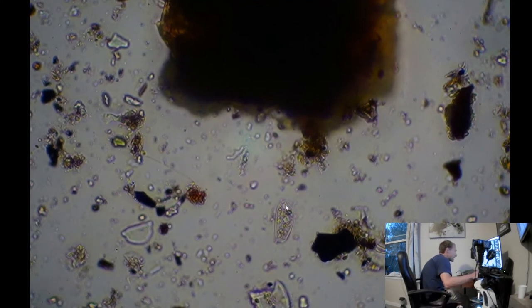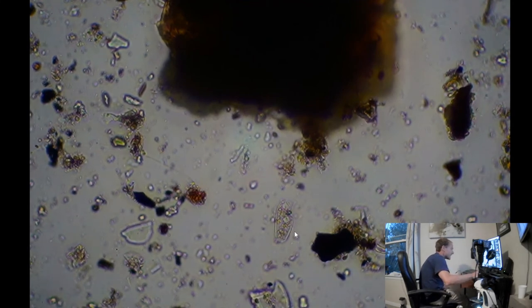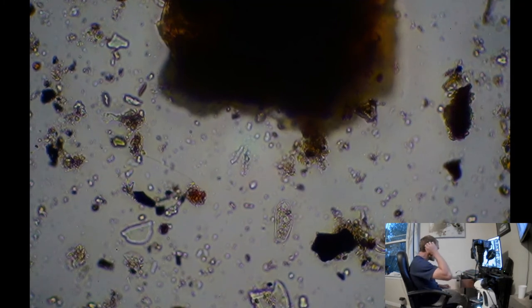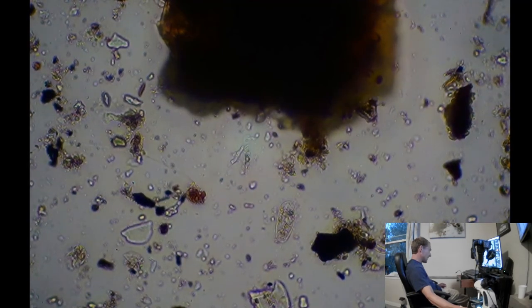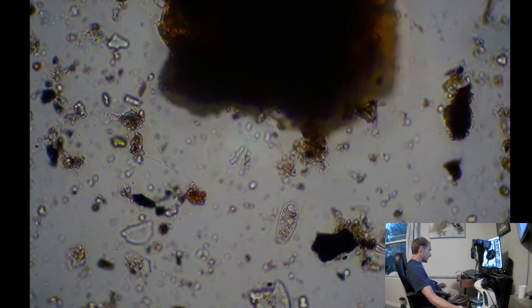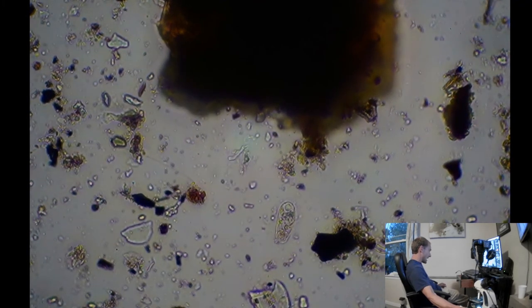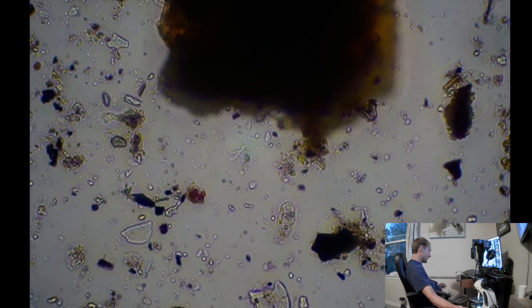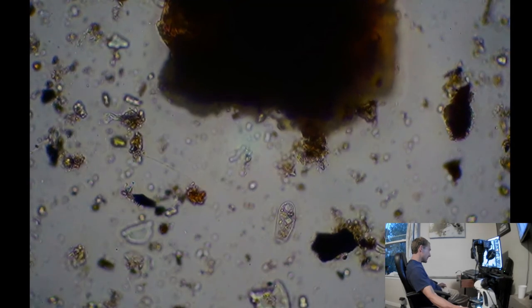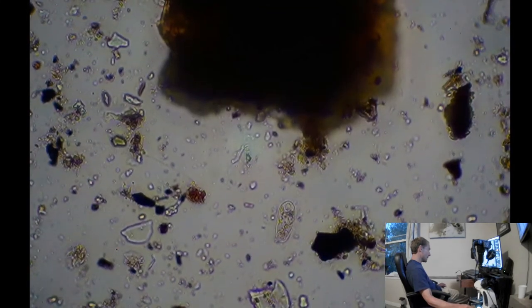And this, I can't remember the name of this amoeba. Testate amoeba, I think. But there's an amoeba for you. Another very good sign and something you want to see in your soil. It's them and the nematodes that are aerobic, meaning they like a lot of oxygen to survive. And they break down all sorts of stuff in the soil and make it plant available as well.